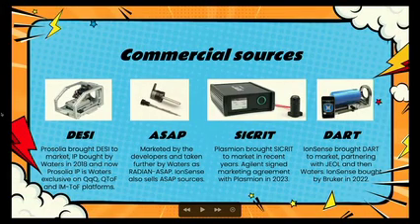So the commercial sources that you may have seen in publications, and these are just some of them, there are other sources available on the market, and we'll cover them on successive slides. But there's DESI, which is desorption electrospray ionization, and that was developed by Graham Cooks's team over in Purdue and brought to market through their spin-out Prosolia.